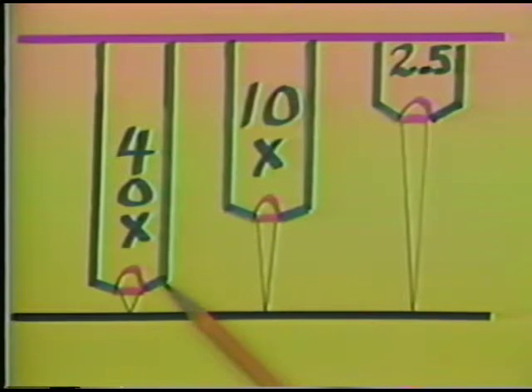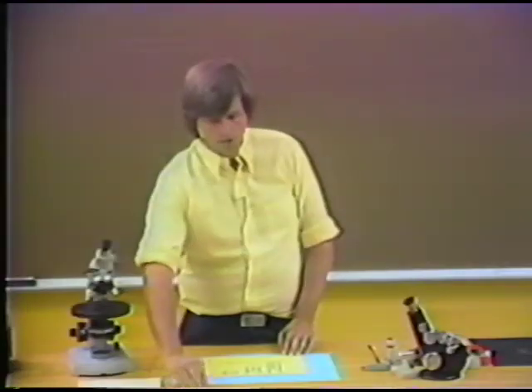So there's a systematic relationship. As you're using high magnification, you have very small free working distance. As you're using low magnification, you usually have a much larger free working distance. And this is the normal relationship of the objectives. And you can also see that the angular aperture for this high power objective is generally larger than the angular aperture for the low power objective.